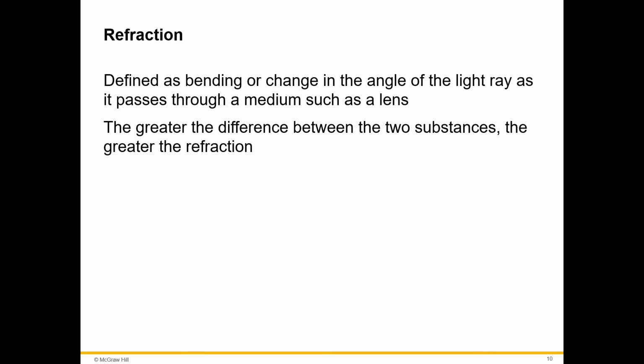Refraction is defined as bending or changing in the angle of the light ray as it passes through a medium such as a lens. The greater the difference between the two substances, the greater the refraction. So if you've ever stuck a stick in water, the stick looks like it's bending. And that has to do with the way that the light is able to move through the air versus the way that the light is able to move through water. Since it moves through water slower than air, you see a difference in the two images.